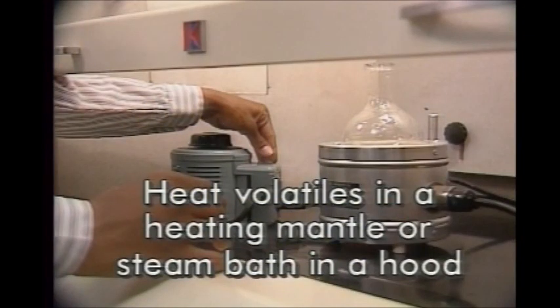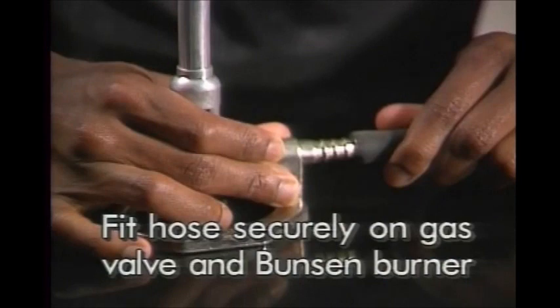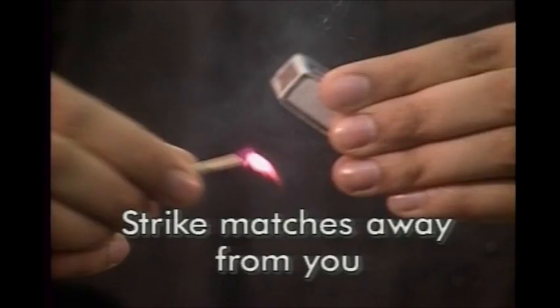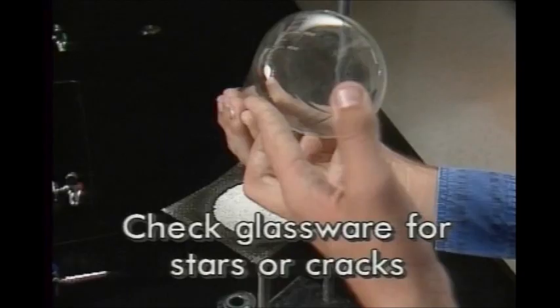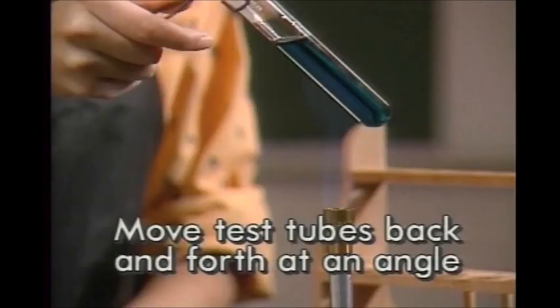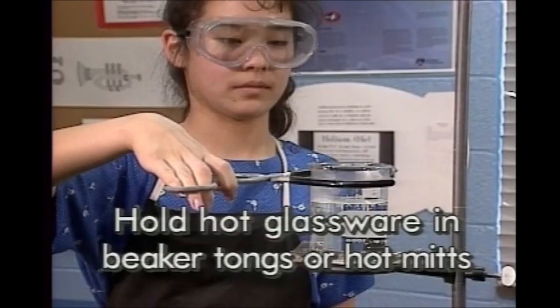Heat volatile organics in a heating mantle or steam bath in a hood, not over a Bunsen burner. Check the gas hose for cracks. Make sure the hose fits securely on the gas valve and Bunsen burner fittings. Stand back from the burner while lighting it. Strike matches away from you. Turn on the gas after lighting the match. Turn the gas off immediately if the flame sputters, flares, or goes out, or if you smell gas. Check glassware for stars or cracks. Clamp narrow-necked containers to the ring stand. Move test tubes back and forth through the flame at an angle while heating. Don't heat closed containers. Hold hot glassware with beaker tongs or hot mitts.